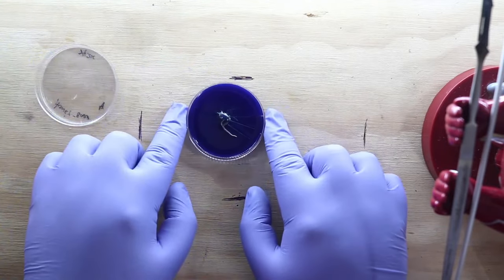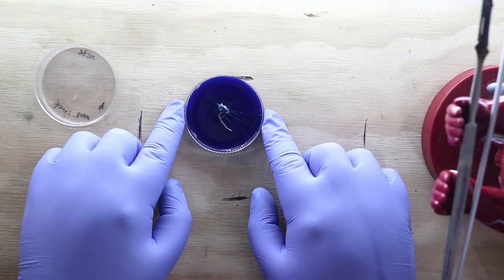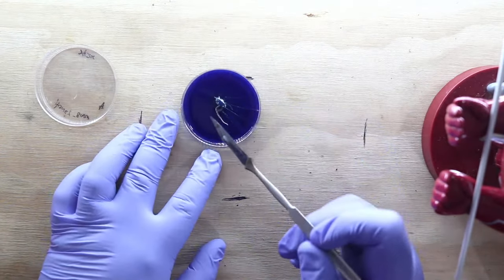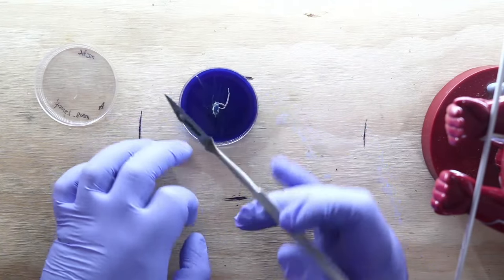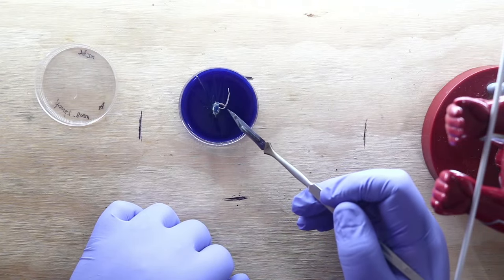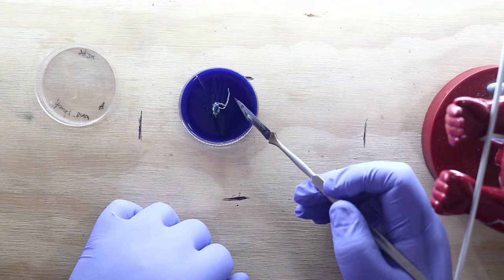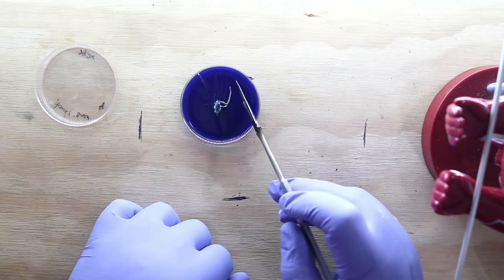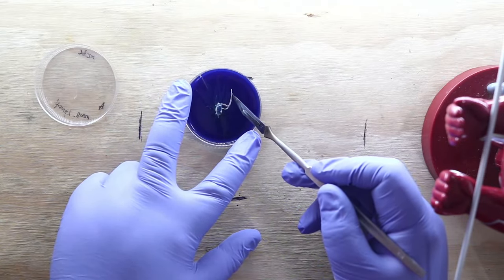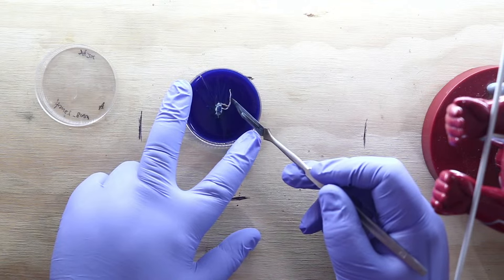Now, this stuff is super cool to me because of these tentacles. Let me torch this. So these tentacles are actually modified rhizomorphs. This is the way the honey mushroom is called a meadow maker. These tentacles right here, let me cool that blade, search out food sources, like tree roots.